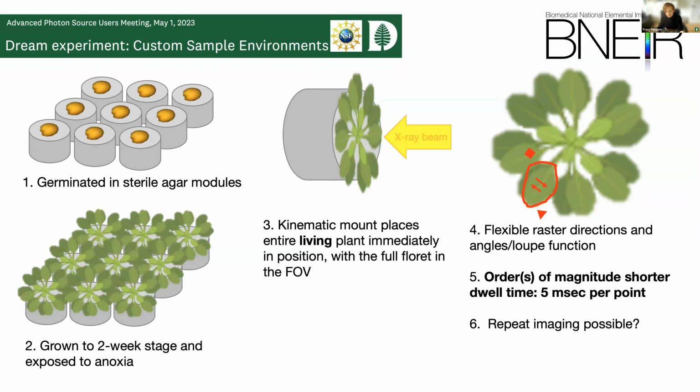So this is what we would like to do, and we're writing a grant right now to try and get this funded. We really need a complete change in how we image plants at the synchrotron. We need it to be much, much faster. And this is what we're trying to develop with Ryan Tapero.